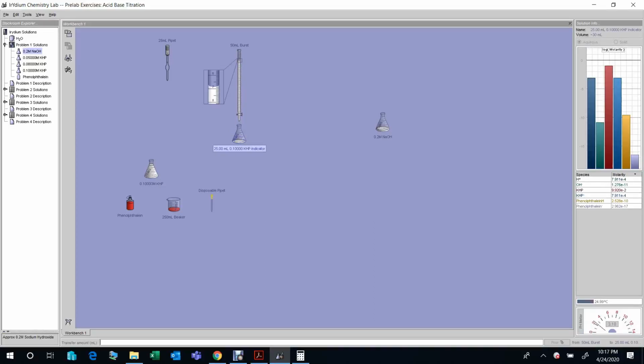Okay, how much should we add? Just now we calculated the rough amount of sodium hydroxide needed to finish the titration is 12.5 milliliter. So it's safe that we can add 12 milliliter solution first, or maybe 12.1. Here we need to be very accurate because the burette is a very accurate instrument, so we can control the amount very well. So we first add 12.10 milliliter, then we pour.